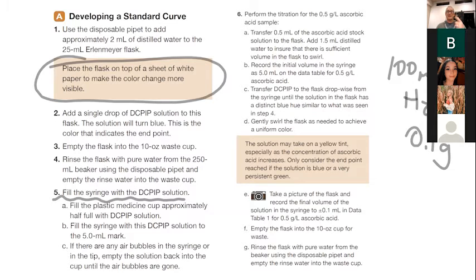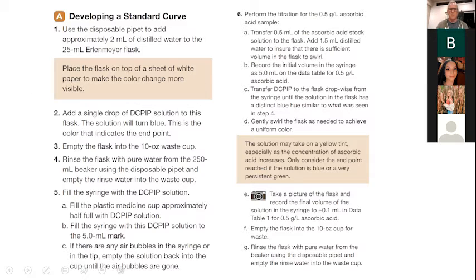So we're going to add different volumes of our stock solution to the small flask and then titrate them, okay? So why don't I just go ahead and show you how that works, and then you can be free. So let me just pause this for a second. I'll move the computer and get set up. So just hang on for a sec.